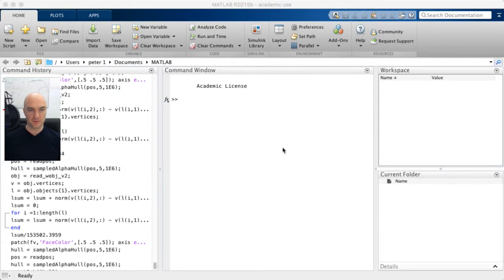You can be very flexible. That's the case with any program where you use a command line rather than graphical user interfaces. The downside is it's not as visual, so you don't get everything nicely prepared for you, but you gain a lot of flexibility.